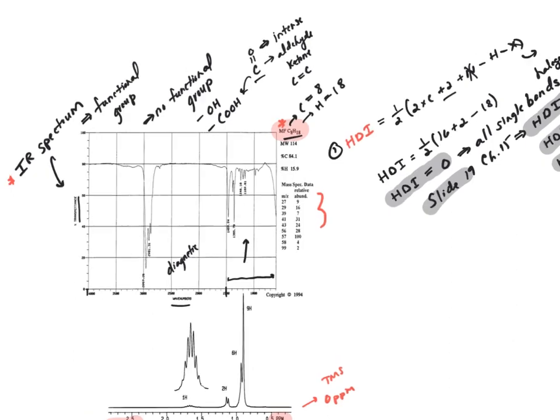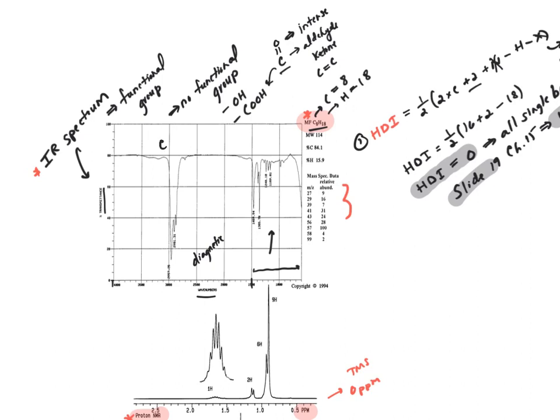But then also be aware of any type of carbon-hydrogen bonding that's found in the carbon-hydrogen region. Depending on whether or not these are sp3, sp2, or sp hybridized, we're going to get different signals in the area where you would expect to find a hydrogen bound to something.